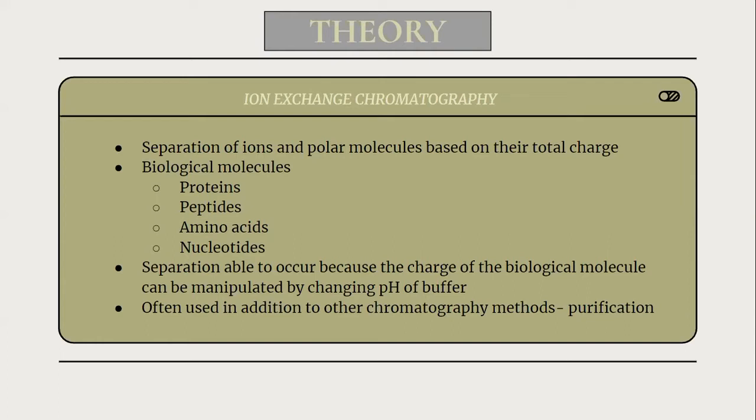Separation is able to occur just because the charge of the biological molecule can be manipulated by changing the pH of the buffer used, and we'll see this in a future slide. This is a method that is often used in addition to other chromatography methods. This is often used as a form of purification and a means to separate the mixture even further.